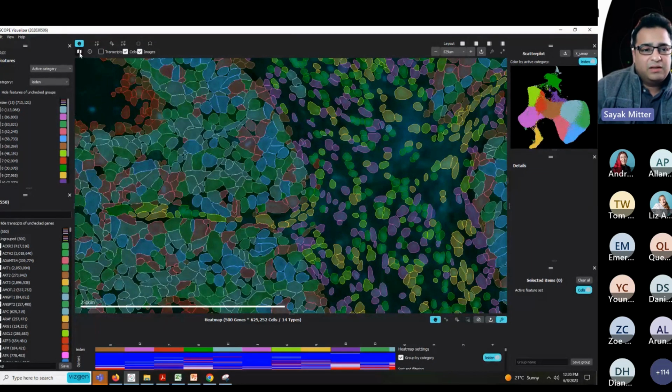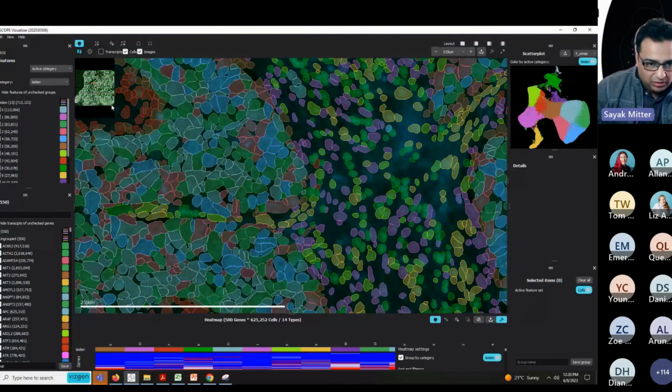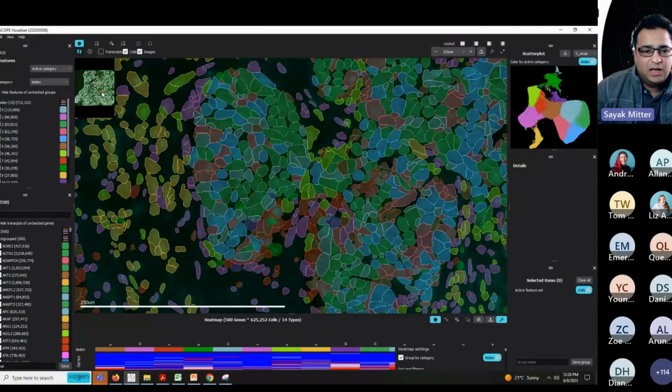What you could do is click on this little mini map on the left here, where you can see the entire thumbnail showing, as it says, the mini map of your tissue, and there is a little red square, which is basically where we are at the moment. So I'm going to left click and drag it, and I can quickly move to another part of the tissue for quick navigation.